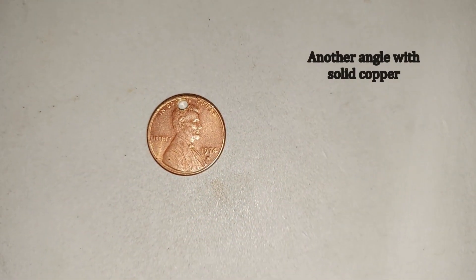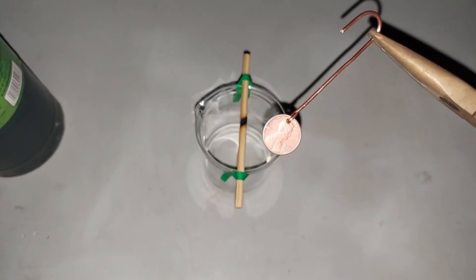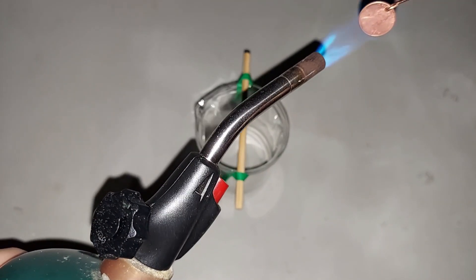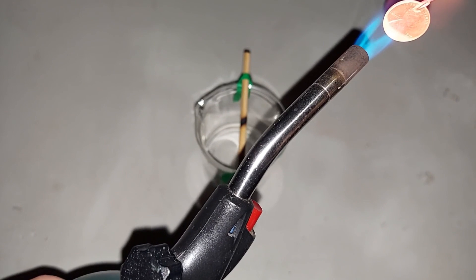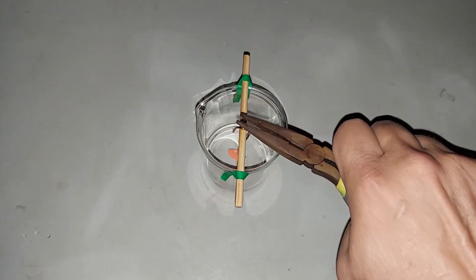Any pre-1983 penny is made of solid copper. Here's our 1974 penny with a copper wire attached to it. Let me heat it now. Hopefully we don't burn through our stick.